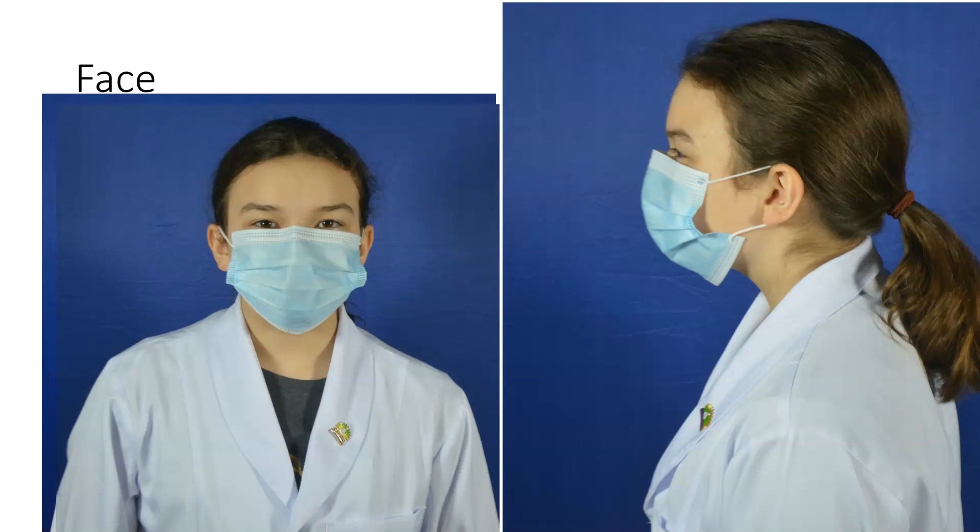Once you get to things that are aerosol transmitted, like BSL-3, no, this is not good enough. We look at this particular type of face mask as a general type that we would use.